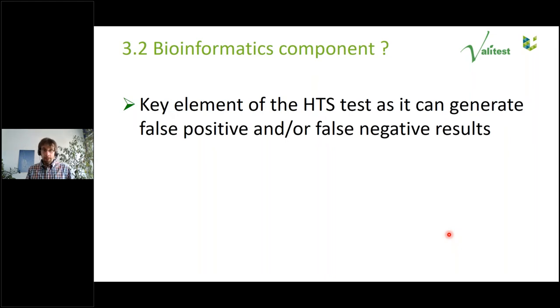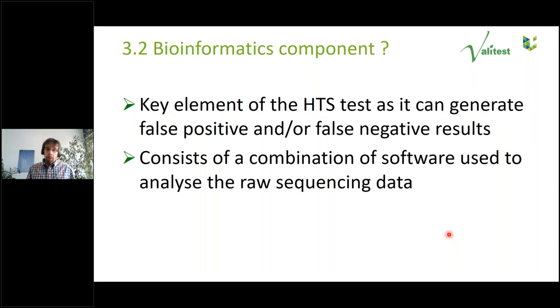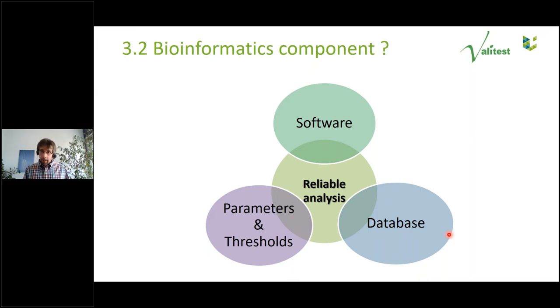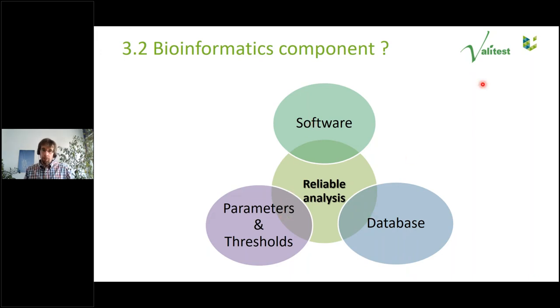Bioinformatics can generate false negative or false positive results. It usually consists of a combination of software to analyze raw sequencing data — even a one-click software contains different algorithms. Reliable analysis depends on three elements: the software used, the database used, and the parameters and thresholds used. You can have the most appropriate software and the most updated database, but use one wrong threshold and it will puzzle your results. All three elements must be taken into account to achieve a reliable analysis.